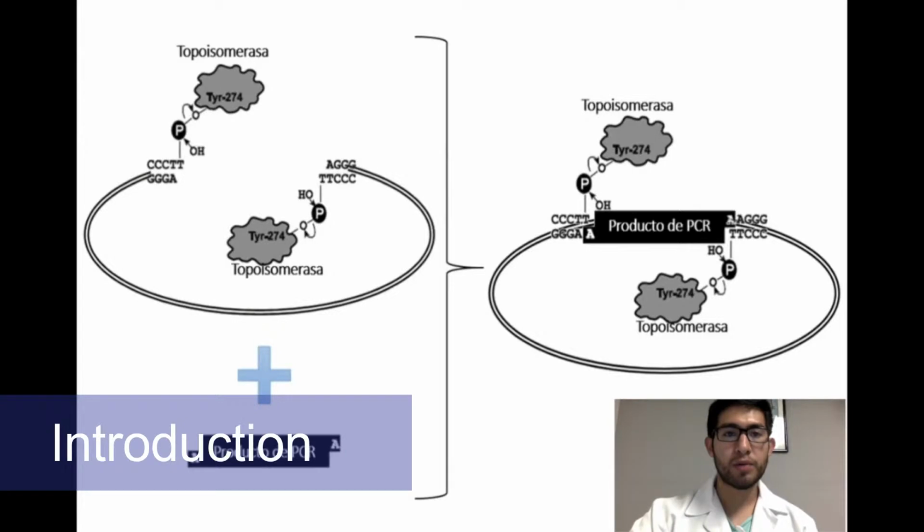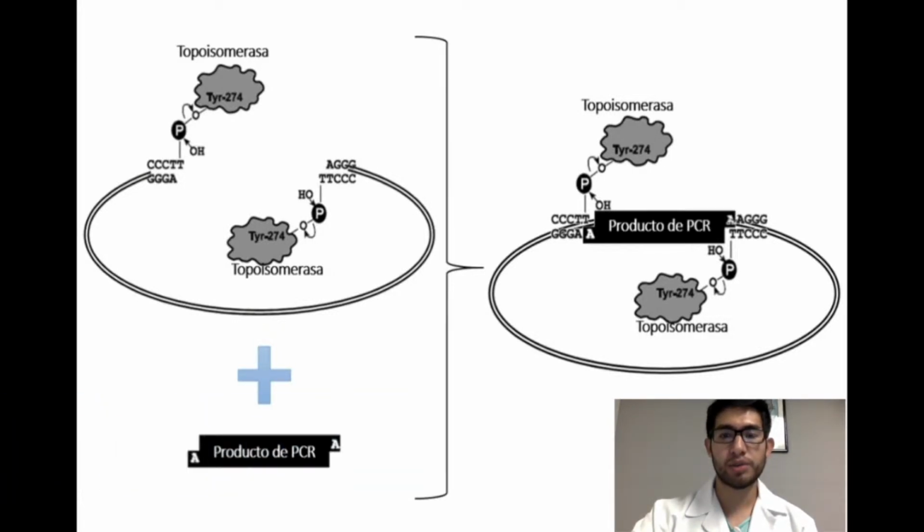During this practice, the ligation of a PCR product to a topoisomerase-coupled vector was carried out, for which it was necessary to know the main constitutive elements of the PCR 2.1-TOPO vector used, as well as the molecular characteristics of the PCR product to ensure the complementarity between the elements of the ligation reaction and, consequently, the transformation of the bacteria. Cloning with PCR 2.1 TOPO is based on the capacity of ligation by the topoisomerase.